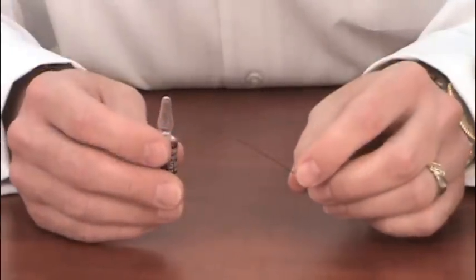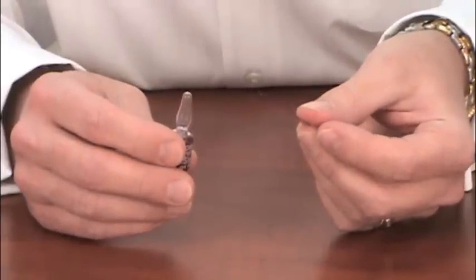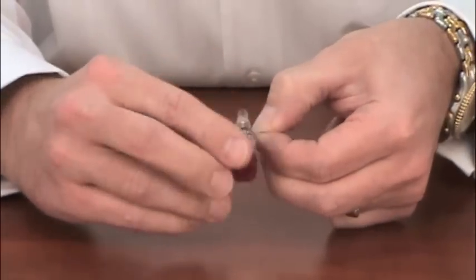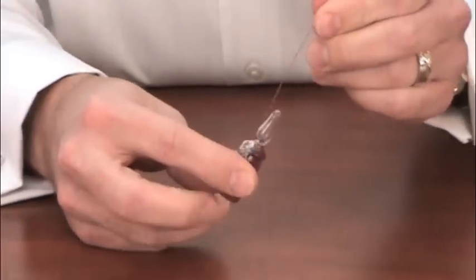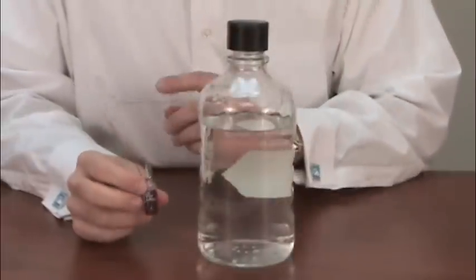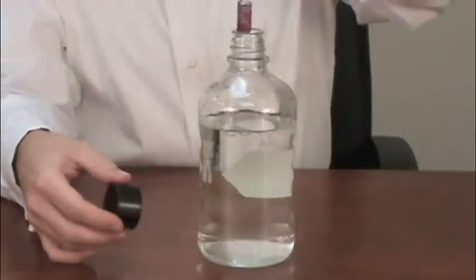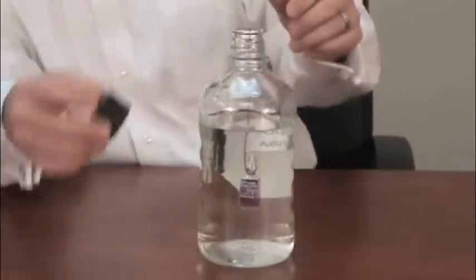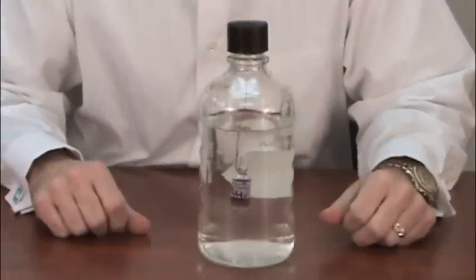To suspend the biological indicator into the liquid, we can take a very thin gauge wire that's easily bendable and simply wrap it around the neck of the ProSpor ampule biological indicator. Give it a few twists to get a snug fit, and now we're going to suspend this or hang it into the liquid load. With the biological indicator attached to the wire, we simply place it in the liquid, roughly gauge the middle of the volume, replace the cap, and we're ready to sterilize.